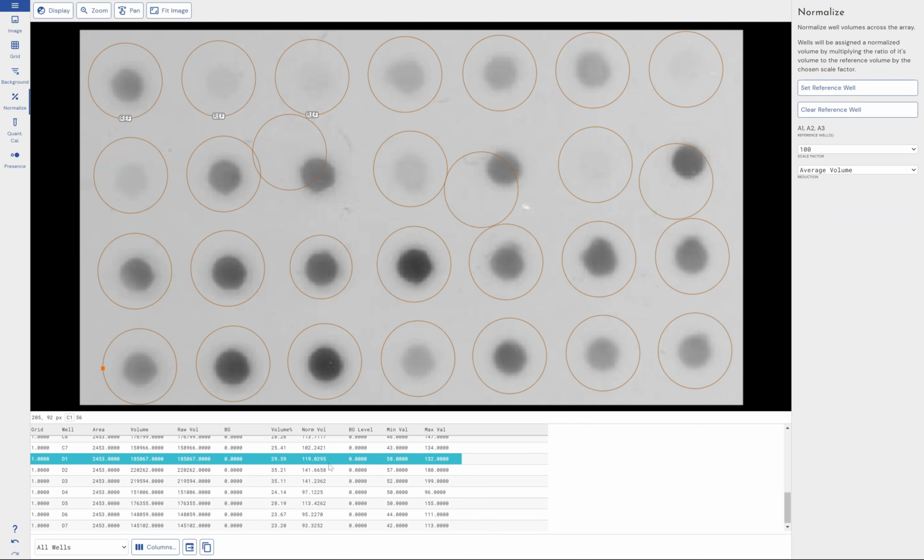It's very useful for showing upregulation or results relative to a control, a positive control, negative control, whatever it may be. So it's just another way of visualizing data and relating data within your experiment. Again, it completely depends on the structure of your experiment, but the tool exists there for you to be able to perform that work.